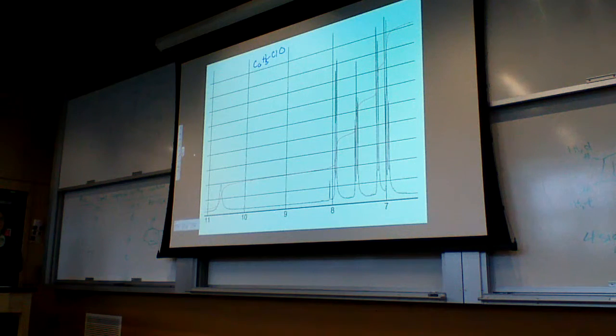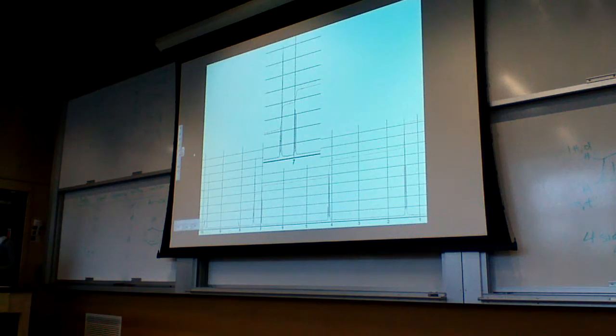The challenge here, when I'm trying to find examples at least, is that you want to have the right electronegativity balance so that it spreads out all the signals. The first example that we looked at here had 3 signals, so we knew that it was a tri-substituted benzene, but 2 of the signals were overlapping each other.